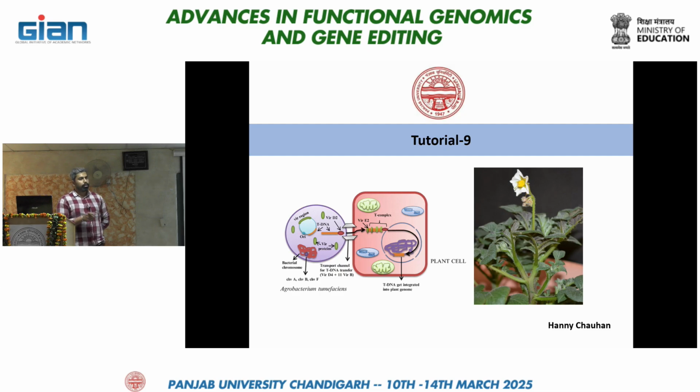So that was our whole part of designing the construct, and after that you have to transform it in a bacterial system, in E. coli, in any strain of E. coli, like DH5 alpha and other strains. So that was in tutorial 7, and we are continuing it in tutorial 9. So here we'll be talking more about the agrobacterium mediated transformation in plants.